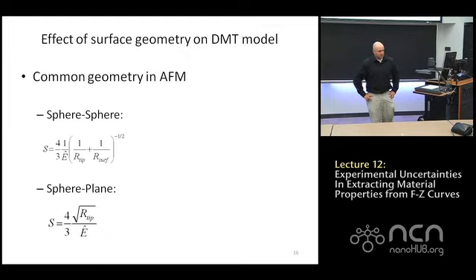Well, in my case, I'm always interested in small indentations. When I say small indentation, I mean that the contact area is small relative to the critical dimensions of whatever you're indenting. In cases where this is not the case, which is especially true in nanoindentation, they often use the Sneddon approach. You have larger forces, so the adhesive forces are no longer so important, and you go back to Hertz.